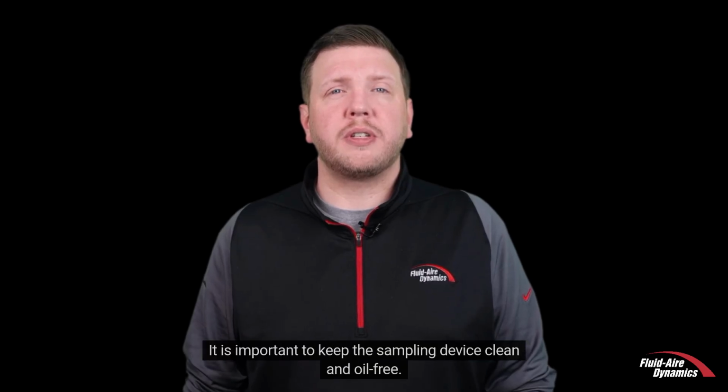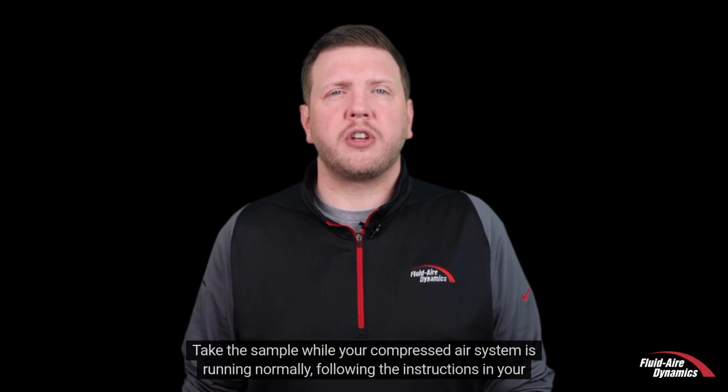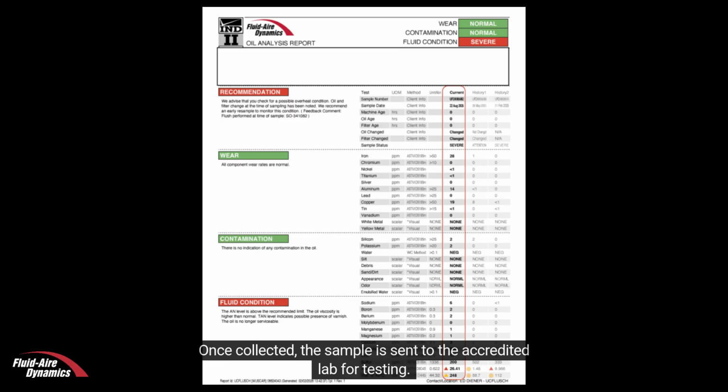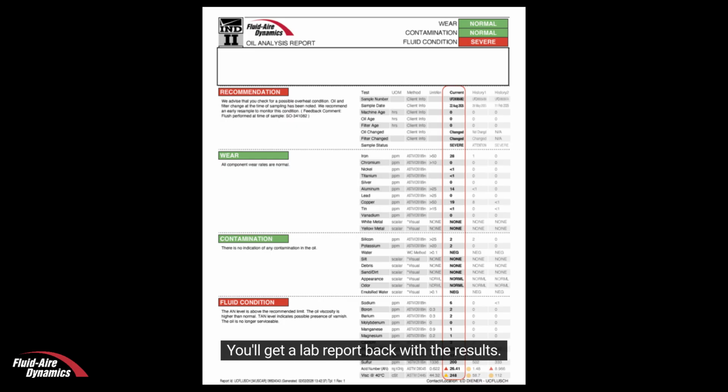It is important to keep the sampling device clean and oil-free. Take the sample while your compressed air system is running normally, following the instructions in your sample kit. Once collected, the sample is sent to the accredited lab for testing. You'll get a lab report back with the results.